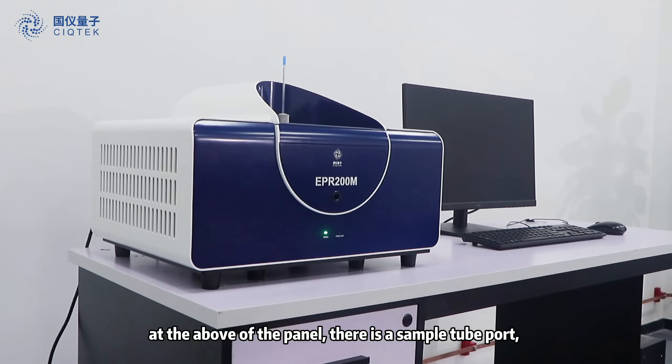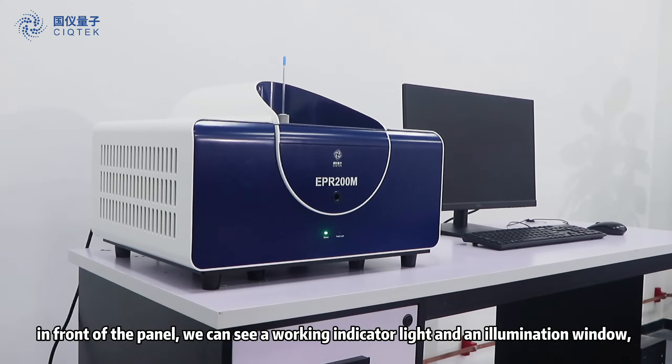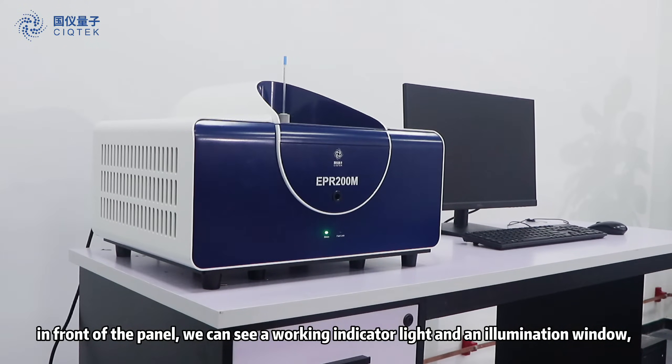At the top of the panel there is a sample tube port. In front of the panel, you can see a working indicator light and an illumination window.